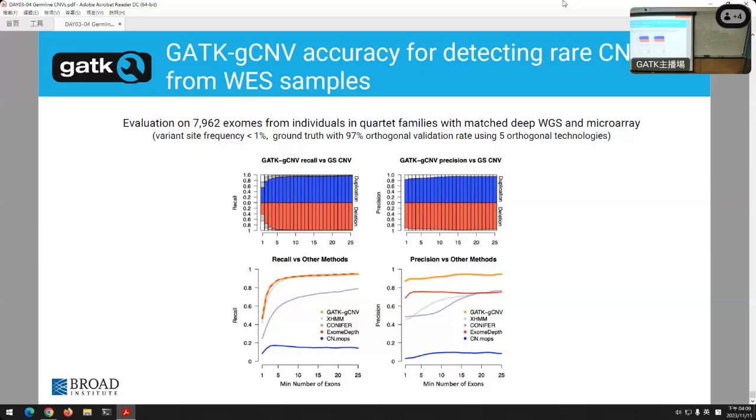In terms of sequencing depth, for whole genomes we typically use around 30x, and around 80x for whole exomes. At least that's what we commonly do in humans at the Broad. I actually don't know off the top of my head if they've tested the impact of different depths.